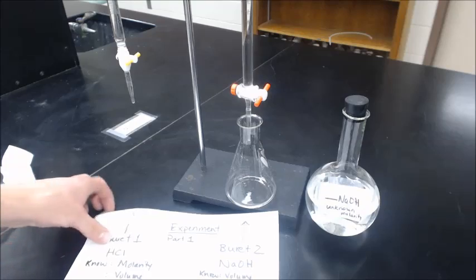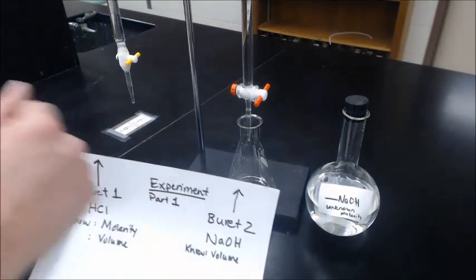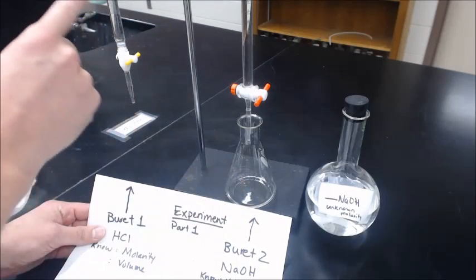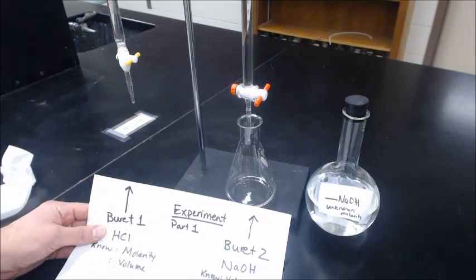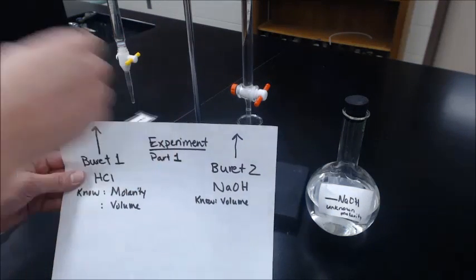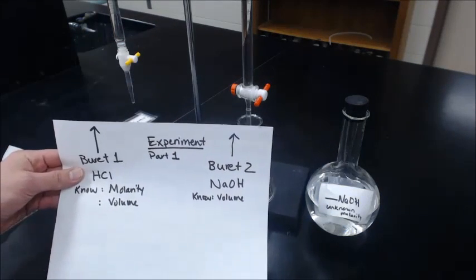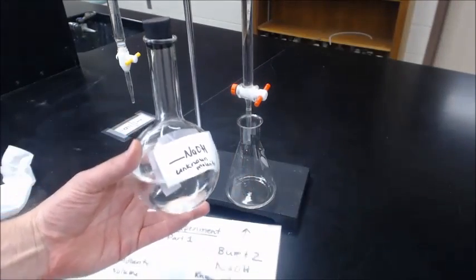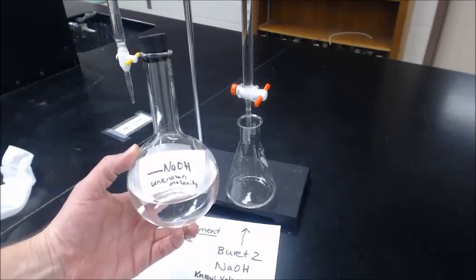Then you know you're done. At the end point, you'll have the exact same number of moles in the flask of hydrochloric acid and sodium hydroxide. You'll know the molarity and volume from HCl, and you'll know the volume here, and you'll solve for the molarity. You'll be able to figure out the concentration of sodium hydroxide.